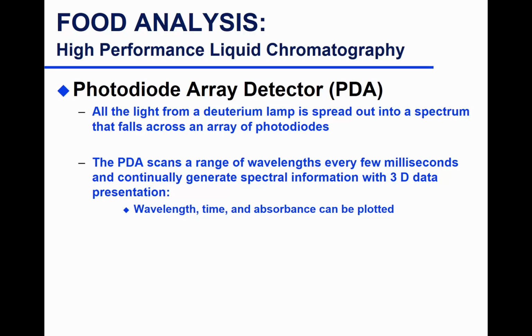But we also looked at a compound that was related, where one had a sugar moiety and one didn't, and they had the same spectra, and that was because the sugar does not absorb UV light. So while this is a beautiful instrument, it still has its limitations. It doesn't give you everything that allows identification.